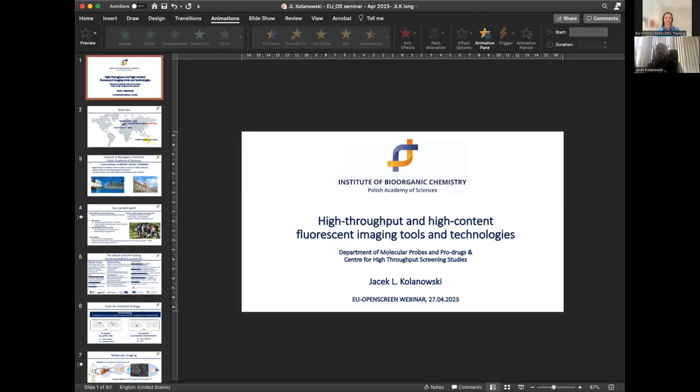This is, of course, a challenge, and people are now trying to move to chemiluminescence. Chemiluminescence is when you have a reaction which doesn't require an enzyme, which generates the signal without excitation. So that's very useful. But systems based on chemiluminescence often require multi-step reactions. So this is another challenge, to have quantification and calibration curves done for the bioluminescent or chemiluminescent responses, due to the cascade of reactions which need to happen for you to actually correlate the signal with the target.